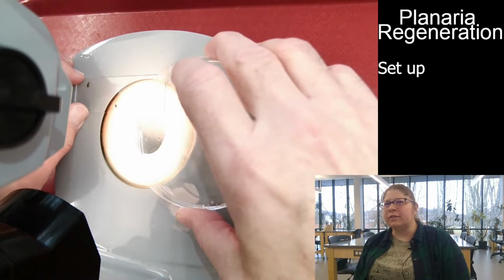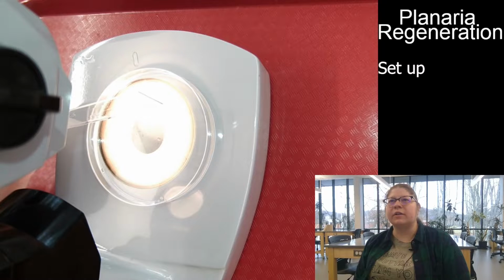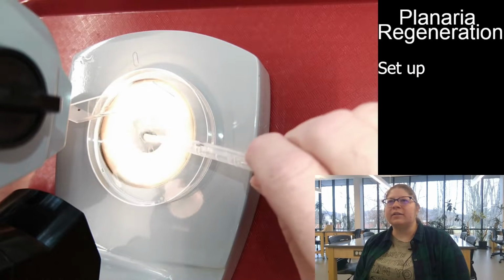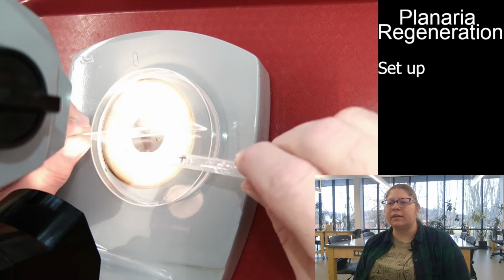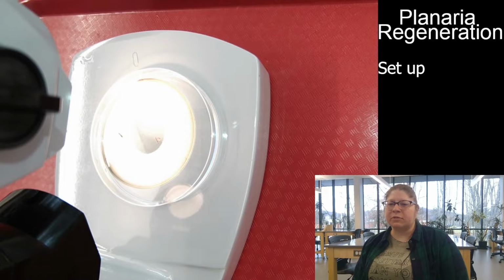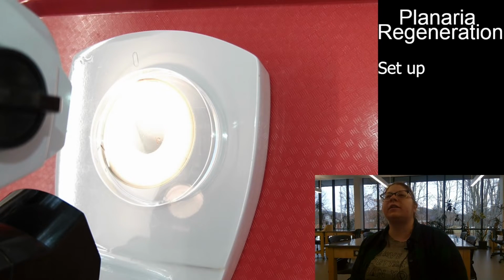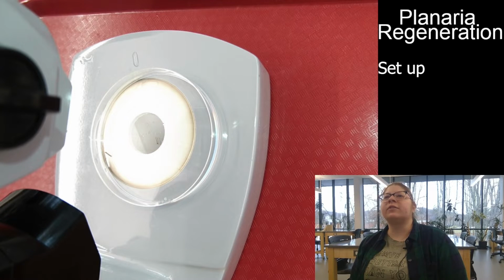So now he is removing the slide from the microscope stage and placing a petri dish with some spring water underneath. And he is gently placing both halves of the Planarian he just cut into the petri dish. This is because the spring water more closely resembles the natural environment of the Planarian than tap water would. It has some minerals in it. And if you look at the petri dish, one half of the Planarian is right in the center, and the other half is over towards the edge. The half over towards the edge is doing a lot more active swimming, but both sides are still alive.